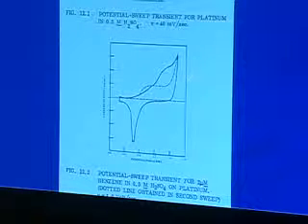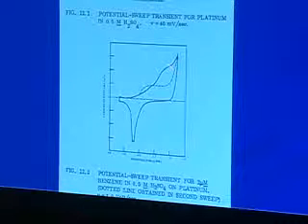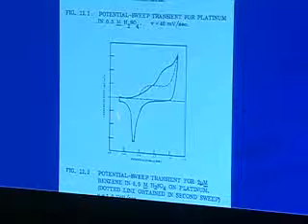What you can see now, way out here, is some kind of an oxidation. You've lost most of the oxide formation in here. There's some kind of a stripping feature here. There's no hydrogen evolution. Benzene initially physisorbs and chemisorbs onto the electrode surface.